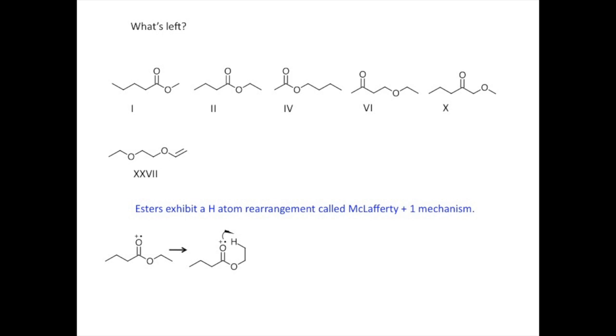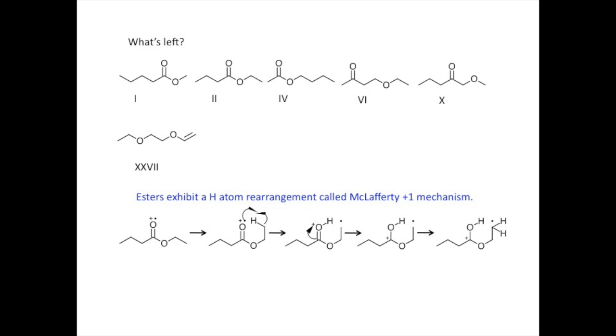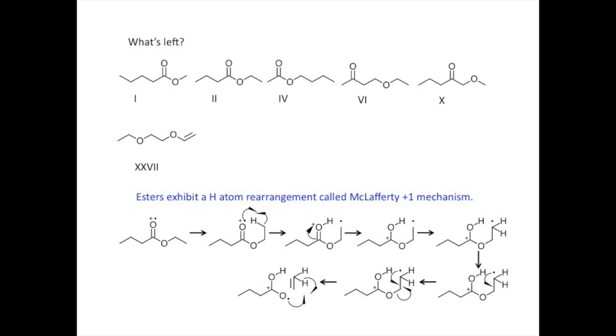The process starts out in the same way as a McLafferty rearrangement. A hydrogen atom is transferred, followed by a pair of electrons moving out of the double bond to the oxygen atom. This transfers the charge to the carbonyl carbon. Now the radical initiates the formation of a double bond, but before the neutral alkene can move away, the free radical, now on the oxygen atom, snatches the hydrogen atom from the alkene. The result is a charged fragment with 2 alcohol groups and a mass of 89.